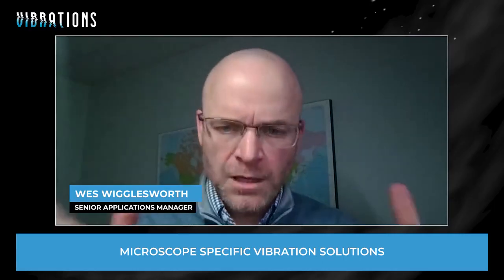But those tend to be heavy platforms that need to fit the microscope. Much different than, say, an SEM base in a conventional lab. So that's a really good example of something that's standard.